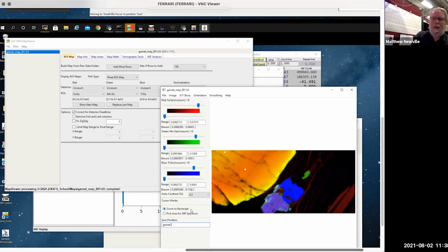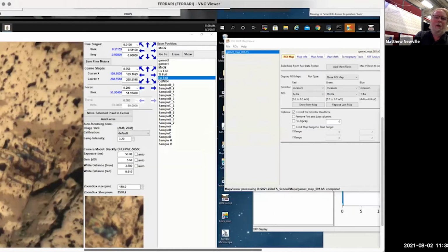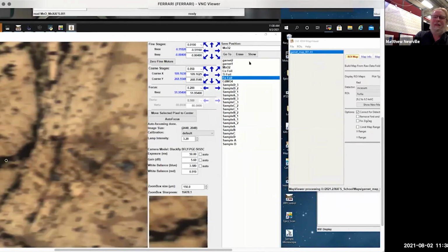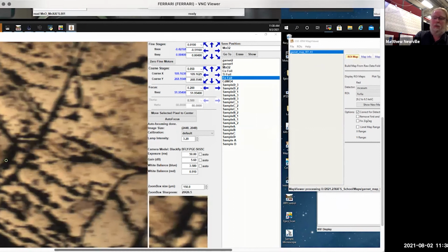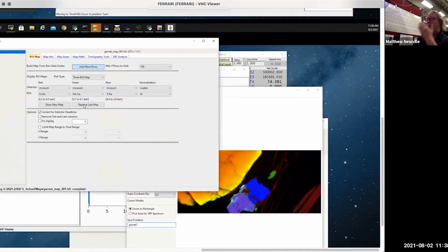These also go into our list of sample positions. This is definitely only at our beamline, or maybe there's a beamline at NSLS-II that might have it. So then I can just set up a queue to do the manganese XANES at those points. We might just do that. That might be sufficient to say we've made a map.